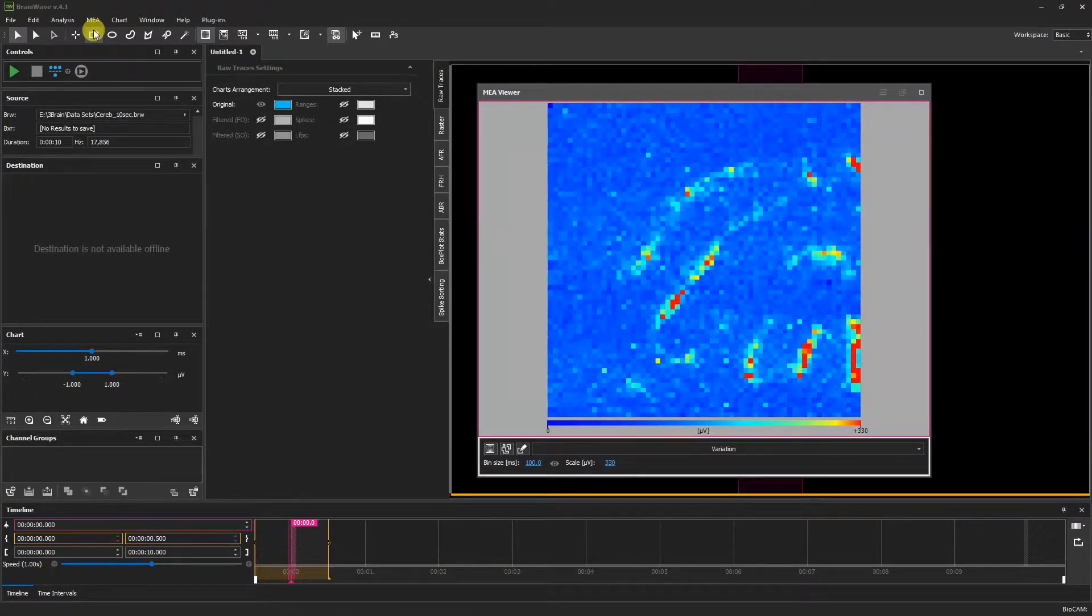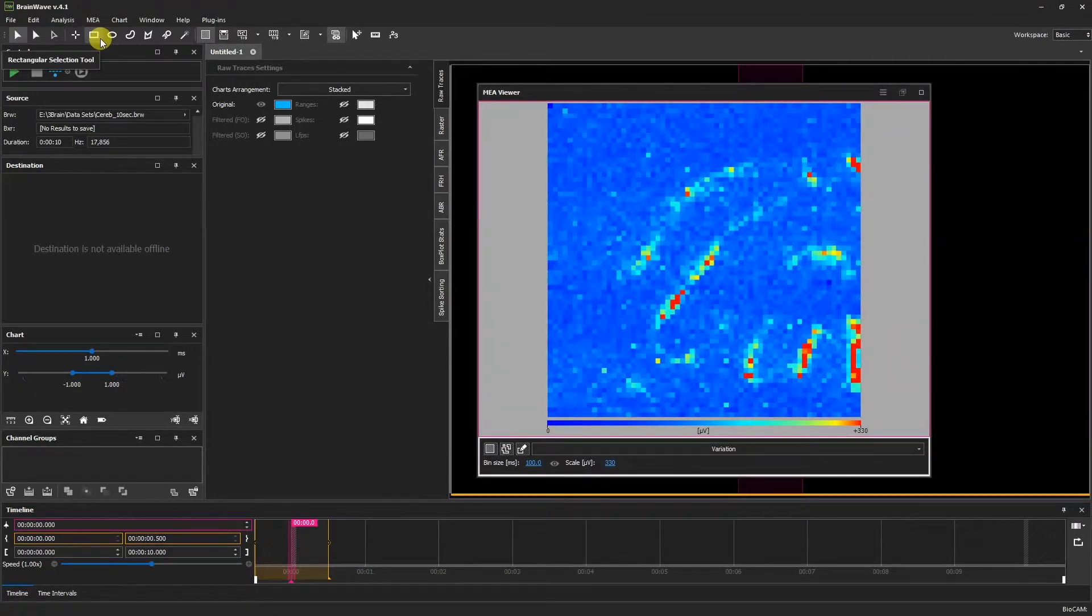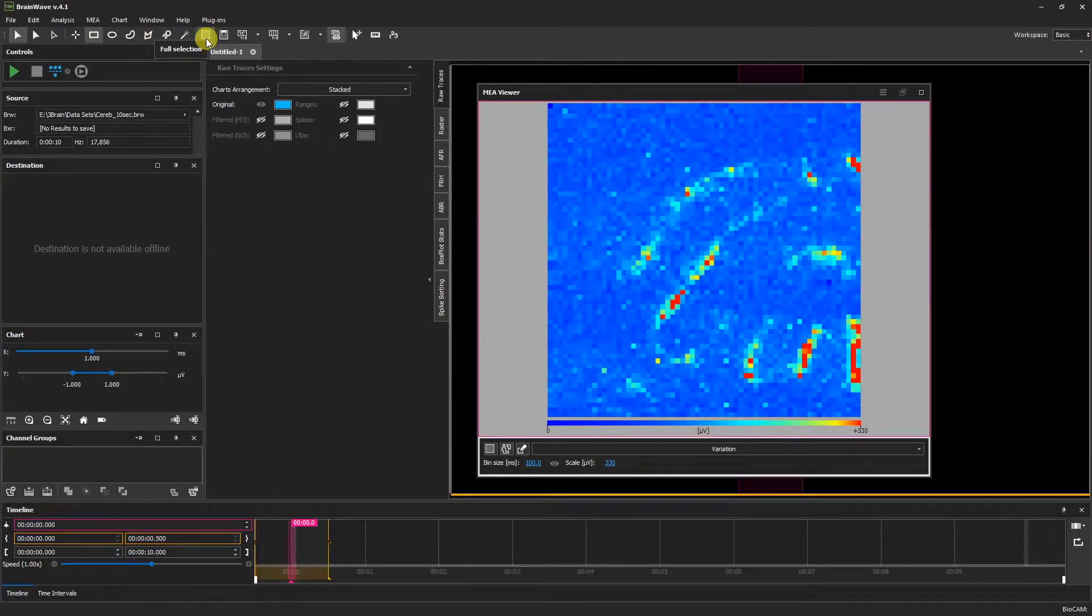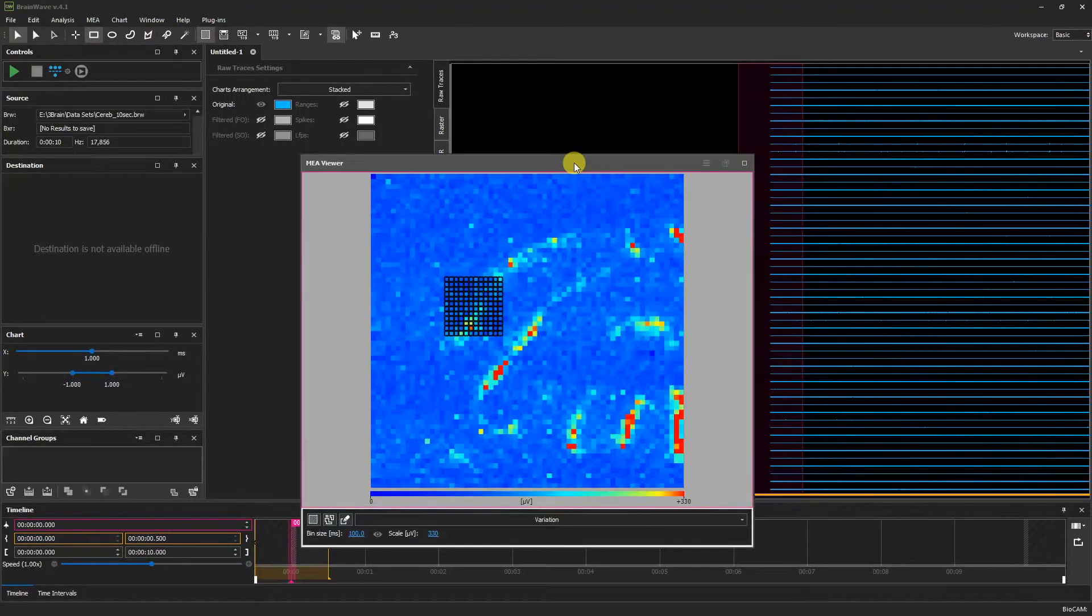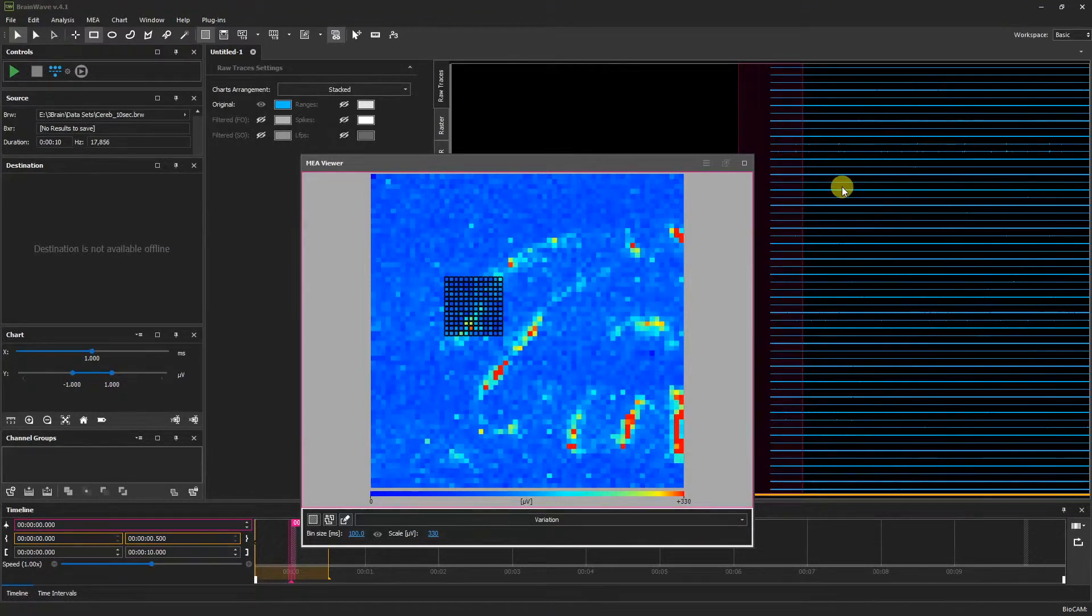Now going to the selection tools. The tools enabled by default are the rectangular selection tool and the full selection. By clicking and dragging, we can select channels on the MEA Viewer and see our data represented in the raw traces window.